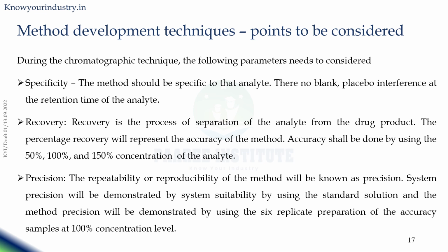So during method development, you selected the detector, mobile phase, the column, the diluent, and the rinsing solution, and some of the sample processing methodology, which includes the selection of additional instrumentation like the sonication process or mixing process, and the filtration process or the centrifugation process. So these are the important steps you already considered for the method development.